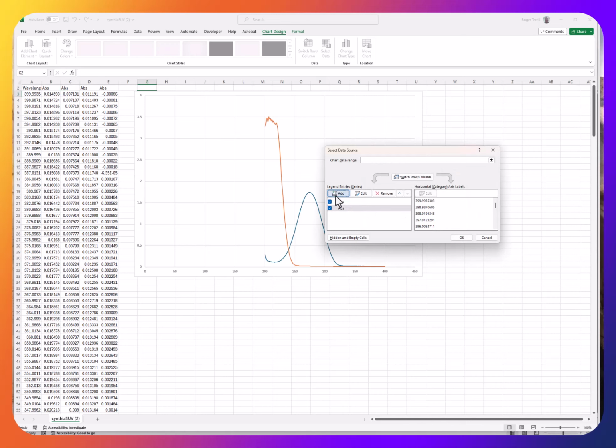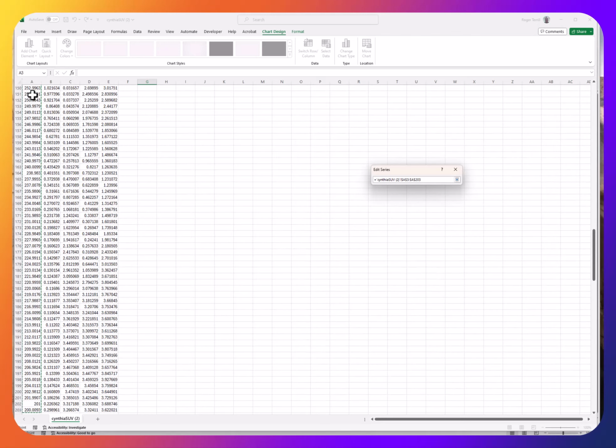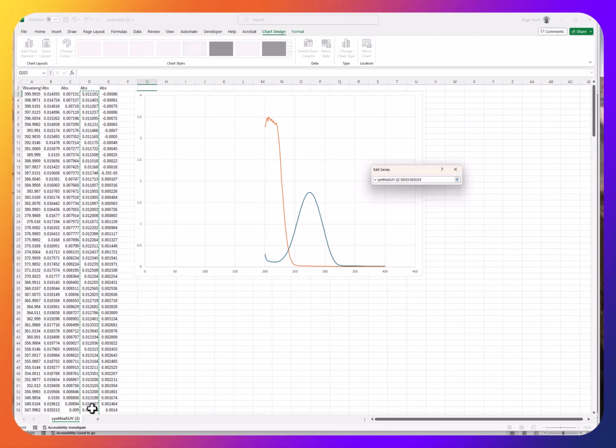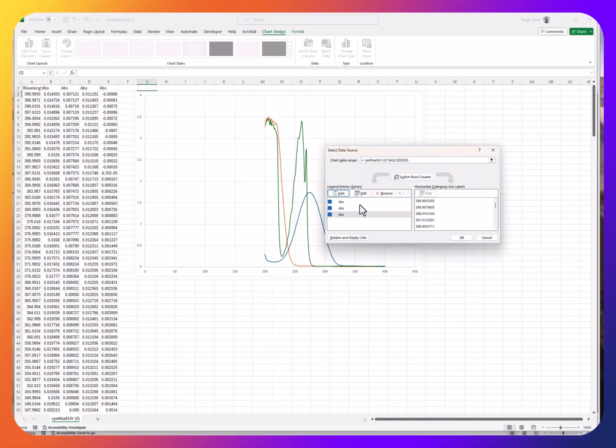And I'm going to add a third column here. X values, same deal. Shift control arrow down. And shift control arrow up. Shift arrow down once. And I will give these this column heading here. Now, OK that. That's toluene.